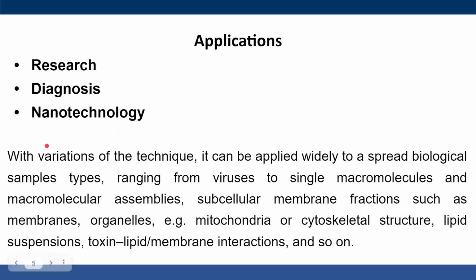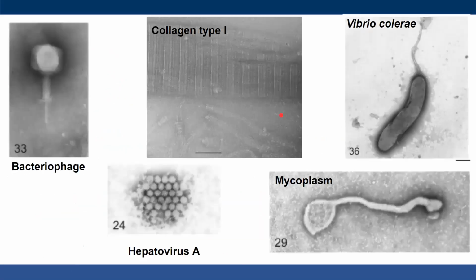With variations of the technique, of course, it can be applied widely to many biological sample types, ranging from viruses to single macromolecules and macromolecule assemblies, subcellular membrane fractions such as membranes, organelles, mitochondria, cytoskeletal structures, lipid suspensions, and toxin-lipid membrane interactions, and so on. So we can use this technique to see and study a lot of things.